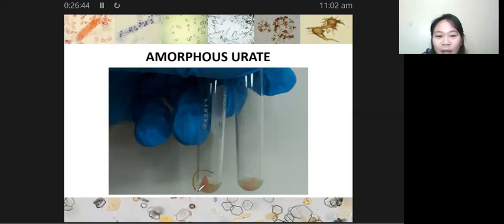Okay, so makikita mo yan, pink talaga siya. Sa mga mahilig ng pink na color dyan, ang cute niya, promise. Pastel pink yung color niya, okay, after centrifugation. So yan yung tinatawag natin na pink brick dust precipitate, which is more distinct after centrifugation and after you have decanted already the supernatant.